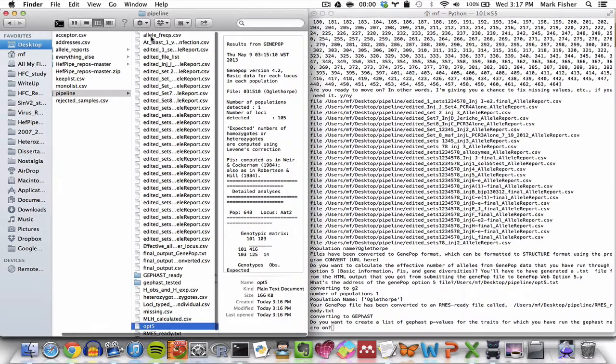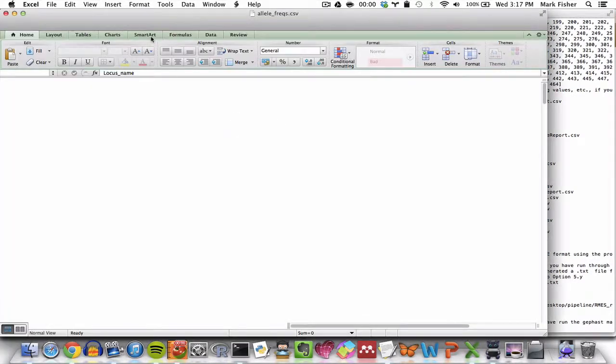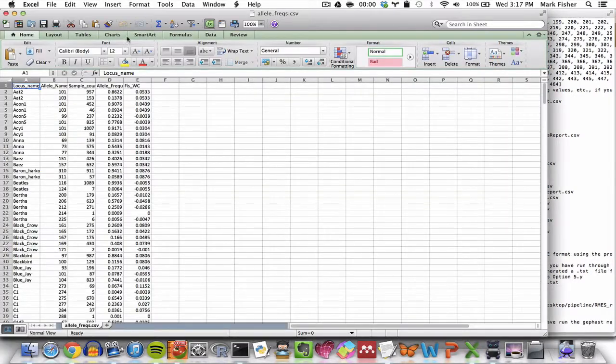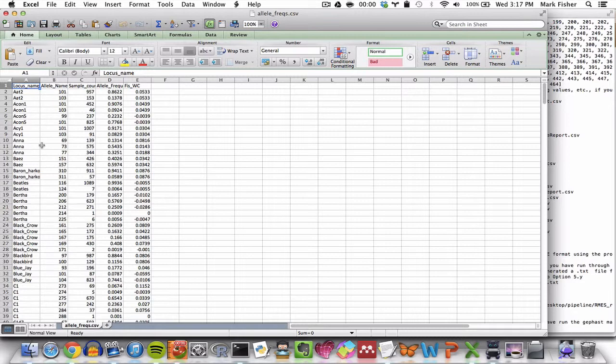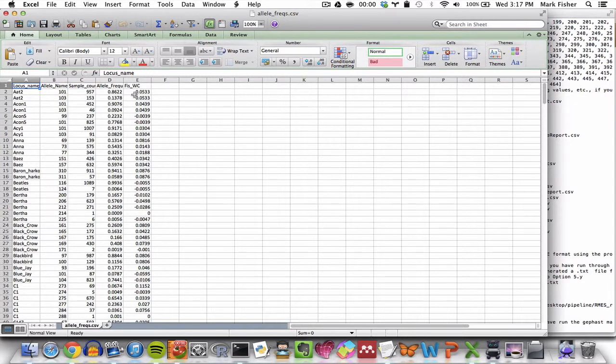So here is what that looks like. So each locus, the allele name, the number of samples that had that allele, the allele frequency, and then Wright's fixation index for that allele.